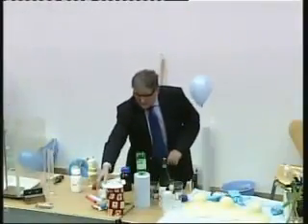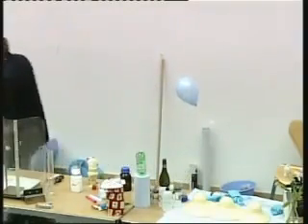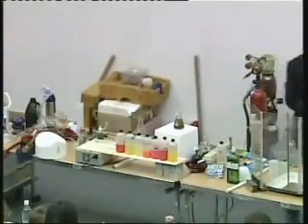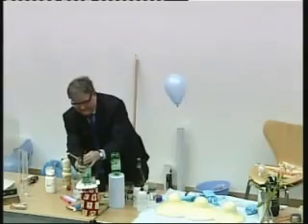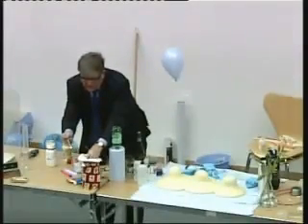Well, I called this lecture Christmas Cracker, so here's my rather feeble attempt at a cracker. Let's see if we can get the best possible chemical mixture to make the reaction go fast, and that's a mixture of gases. So here we have a mixture of gases. You need three hands when you do this lecture.